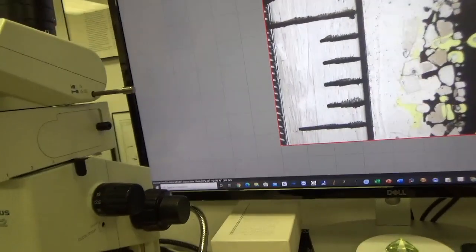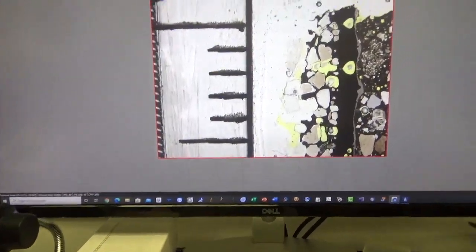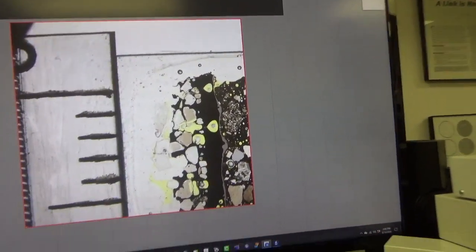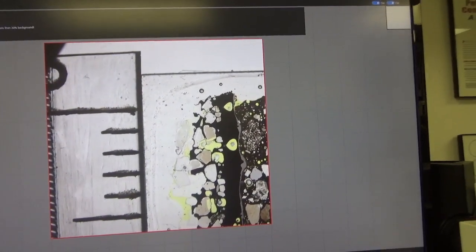And then the third thing is you don't scan too fast, you go slow. If you go too fast, then you will have something called image blur, where certain areas of the final scanned image will be out of focus, blurry patches. You can remove that image blur by reducing the scan speed, by making sure that you set your preset values correctly, the brightness, the gamma, the gain values, and you scan it slowly, and you have about 20% overlap.